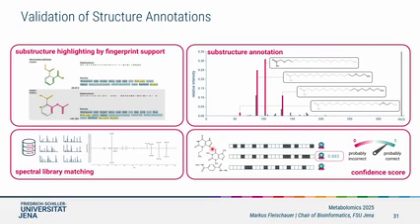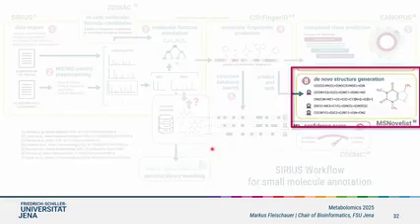So now we talked a lot about comparing against structures that are stored somewhere, but we also have a method to help you out in other cases. We developed that together with Nicola Zamboni.